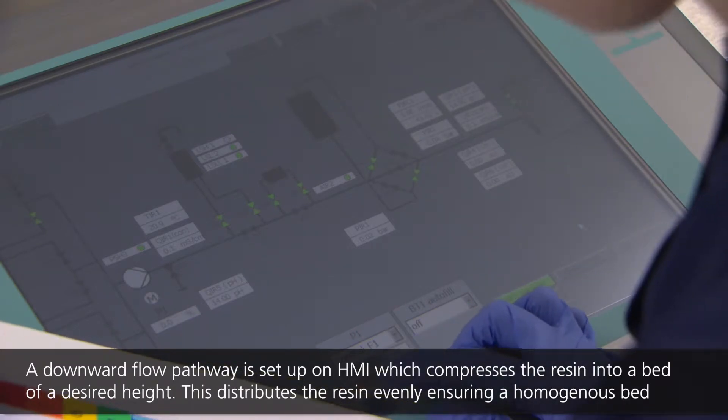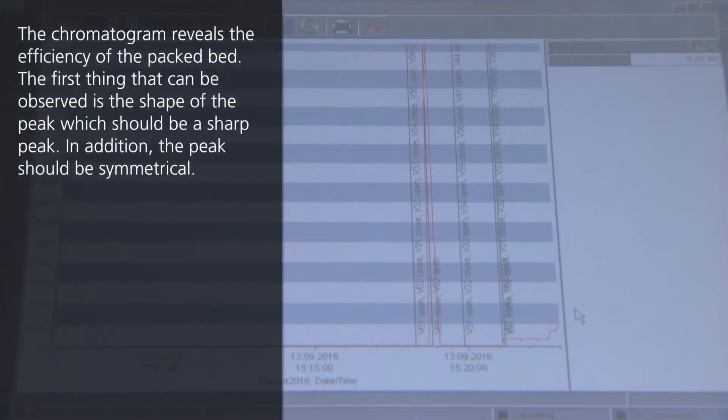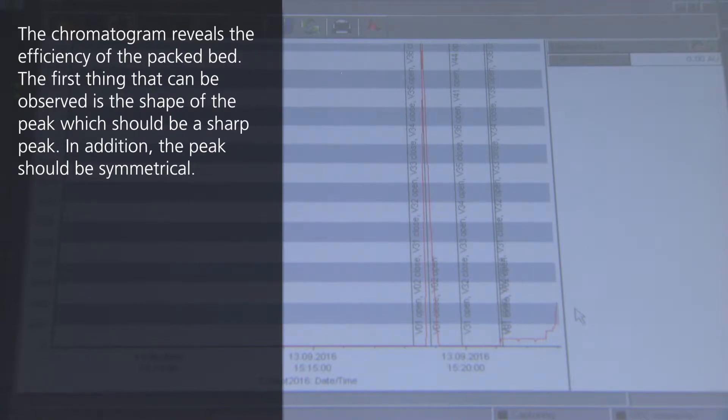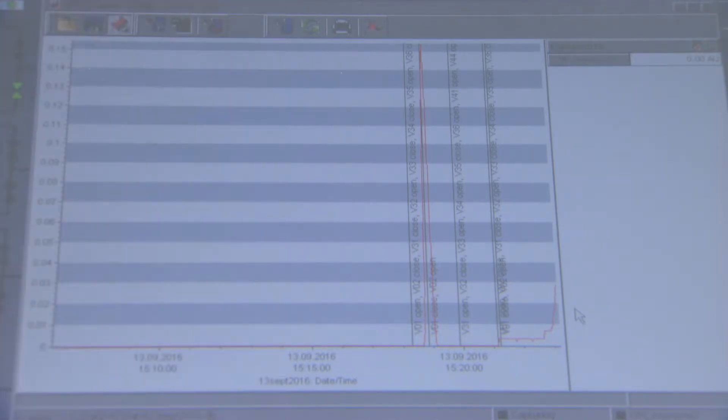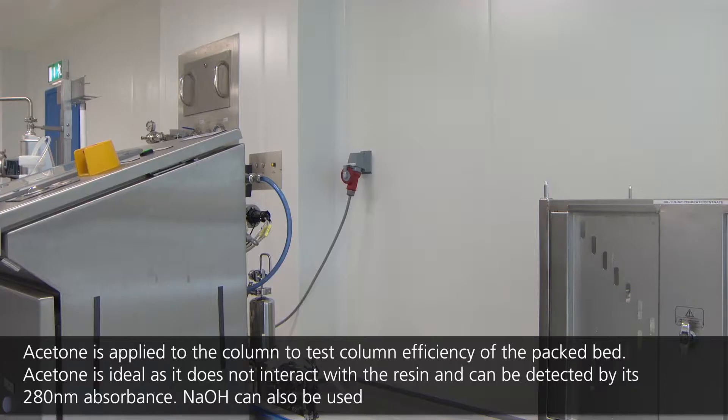As pressure builds, the operator stops the packing procedure when a defined pressure is reached on the HMI system. A preset maximum pressure threshold has been set in accordance with the pressure tolerance limit of the resin. Exceeding this value can result in damage to the resin beads, therefore the system stops pumping if the operator fails to hold the procedure below a defined packing pressure specification. The height of the resin bed is checked, and the process may be repeated until a desired bed height is reached as per the SOP.